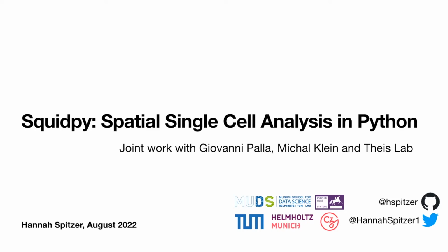Squidpy is very much a joint work together with Giovanni Palla and Michael Klein, who are two of the leading developers in this project, and many other members from the Theis lab. This was very much a joint hackathon project. This is how it all started. And now we're quite happy that this has already been taken up a bit by the community. And I'll also say something about how we plan to extend the software at the end of the talk.